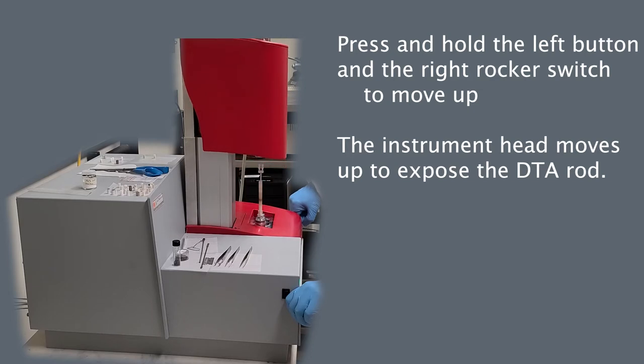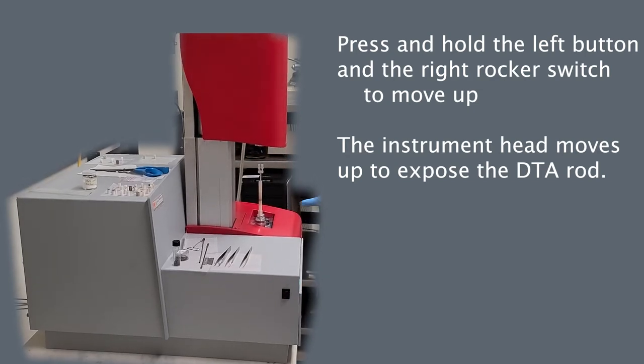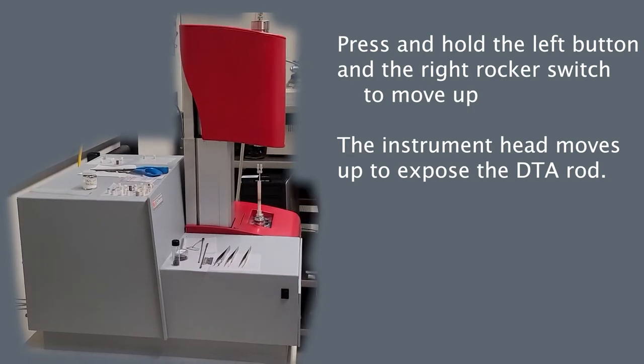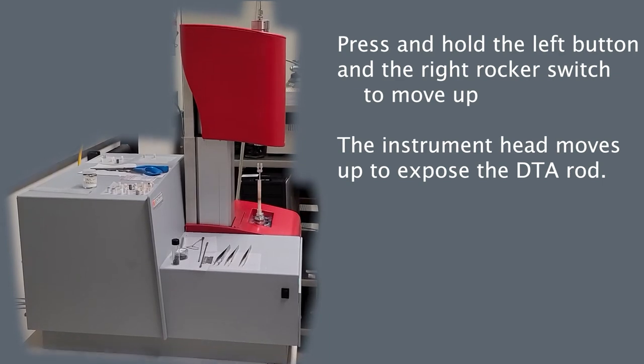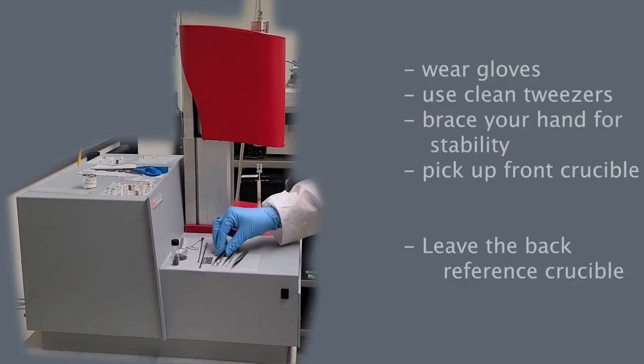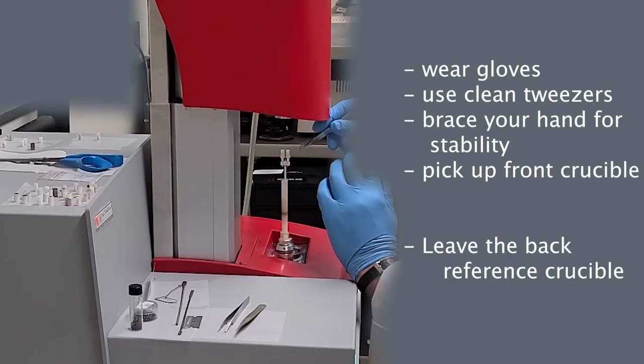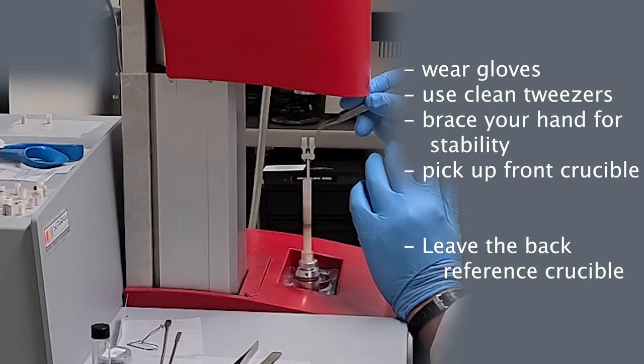With the head pulled up, we can now see the assembly rod with two crucibles. This is the rod for DTA. Wearing clean gloves, pick up one of the clean pairs of tweezers on the side of the instrument.